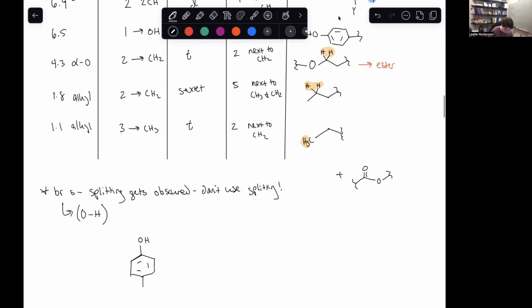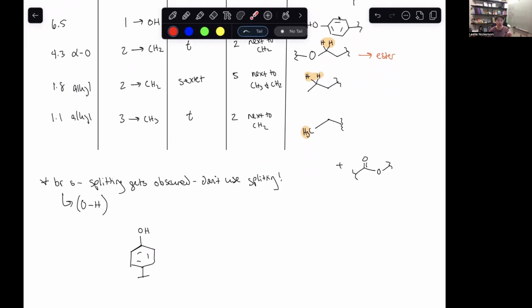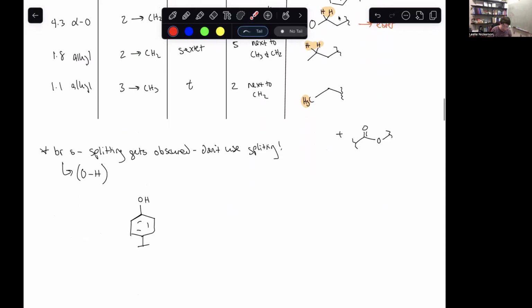Okay, so I need to figure out what goes at that connecting point. When we're looking at what to put next, we really need to look for something that has multiple connection points to it, right? So for instance, if I just plunked that piece on and said CH2, CH3, done, at this point, unless I start messing with the fragments that I've already generated here, this is not matching the molecular formula that I was given.